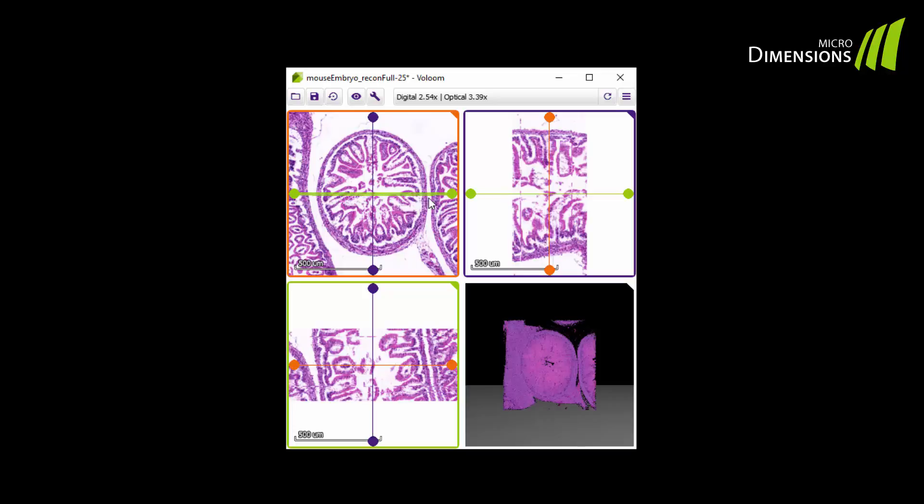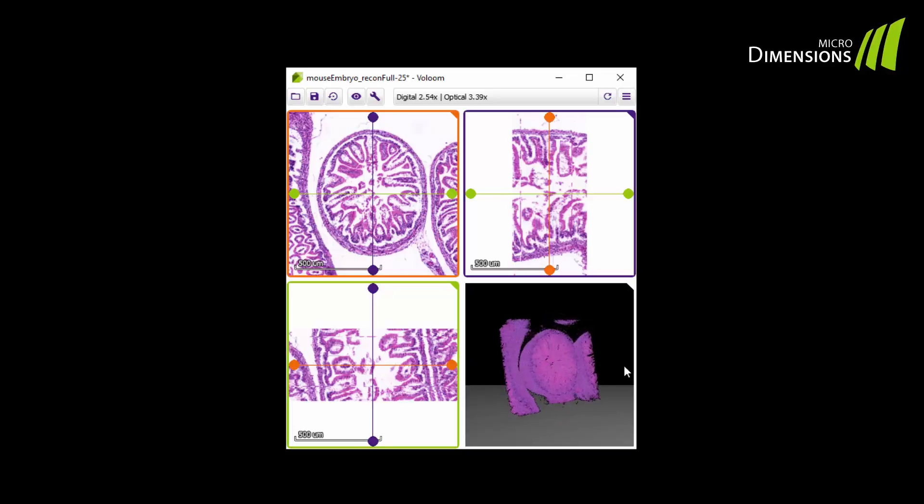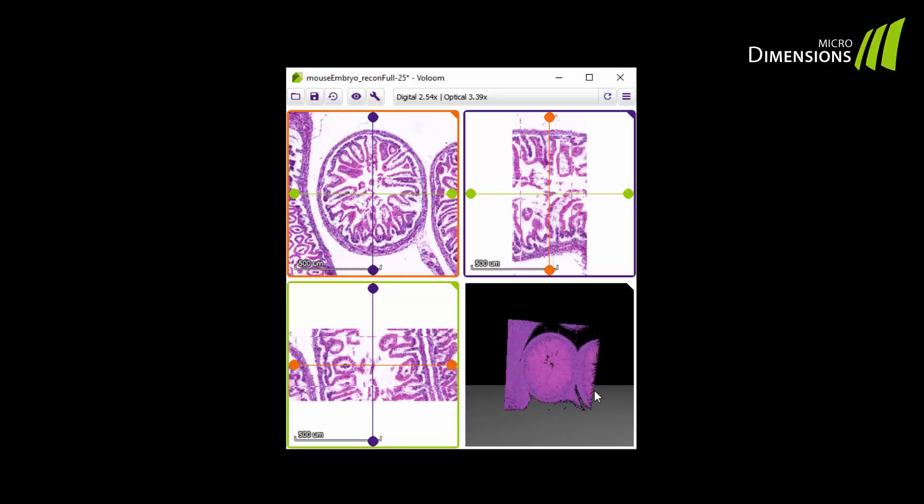In the lower right corner of VOLUME you find the volume that you have reconstructed from your serial sections. By clicking and dragging the volume with your left mouse button you can rotate it freely around any axis.